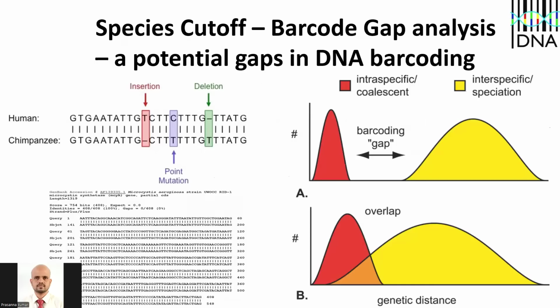Okay, why have such a cutoff? See, in microbiology, it's a gold standard that if you want to propose a new species, you need to go for sequencing. When I do a BLAST analysis, comparing my query sequence with the reference sequence, if my percentage of similarity is 96%, instantly I know I have a new species. Because the cutoff range is 3%, and this is more than 3%, and it is not in the library. That's why the maximum percentage of identity is 96. There are other assays like DNA hybridization and whole genome sequencing to declare it as a new species.